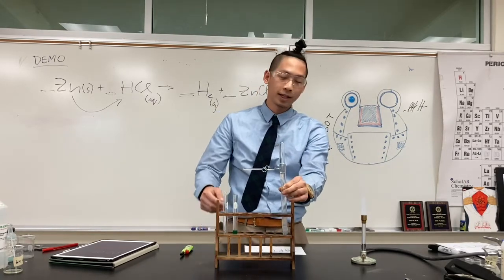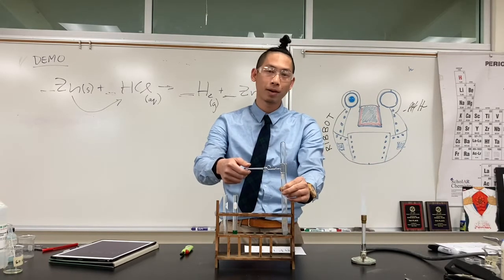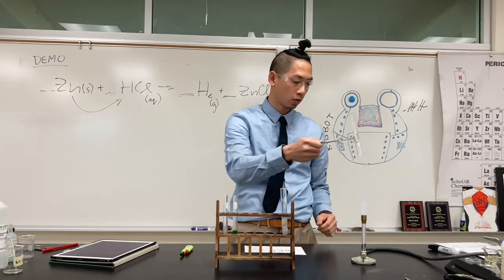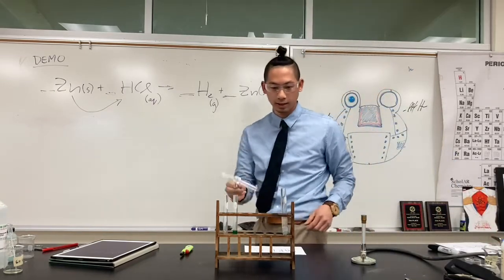All right, that should be enough gas. So let's see if I produce some hydrogen gas. You should hear a loud popping noise. Woo! Let's go. All right.